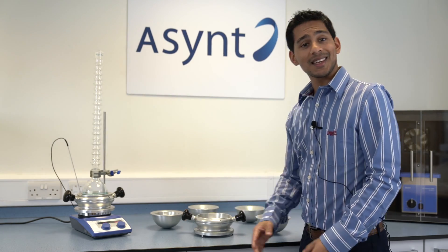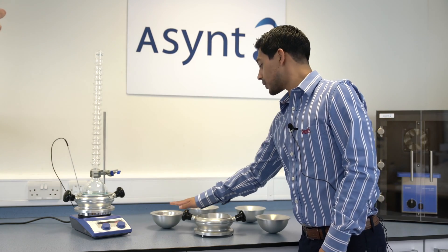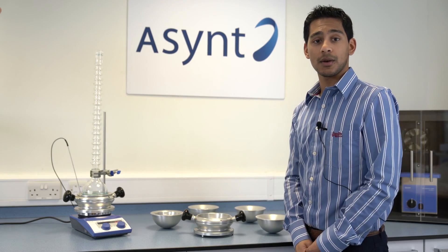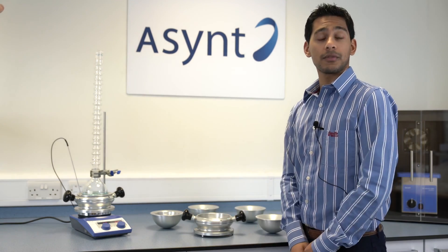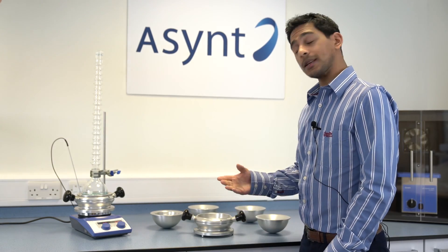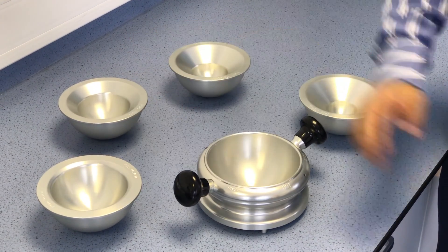The DrySyn Classic kit comes as the 1 litre base with all of the inserts — the 500, 250, 100, and 50 mL — providing a kit for all your common flask sizes. If you prefer, there is also a starter kit which consists of the 1 litre base with just one insert of your choice.